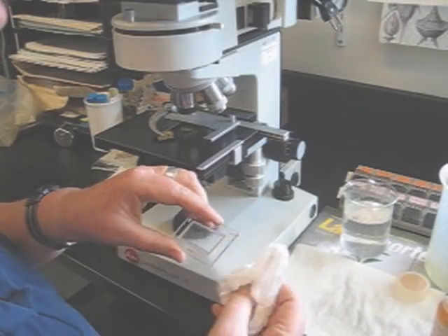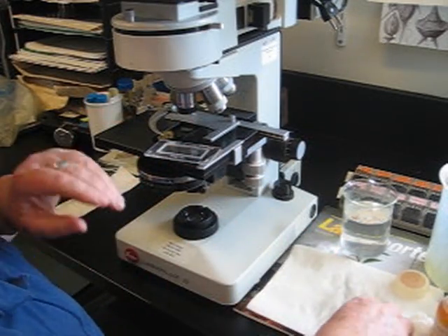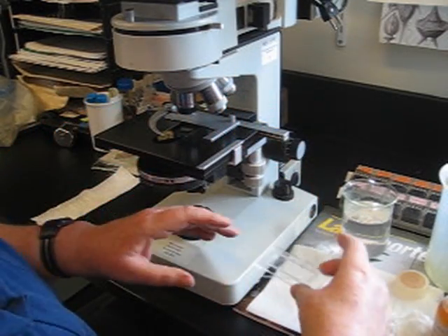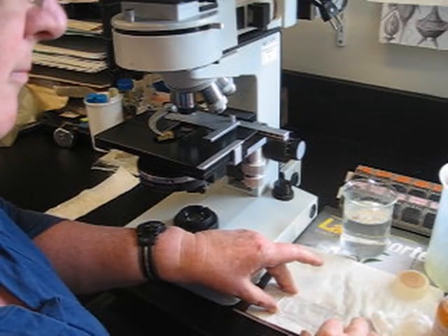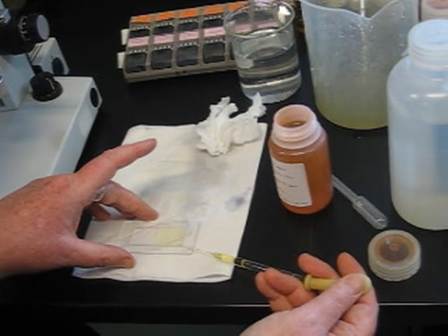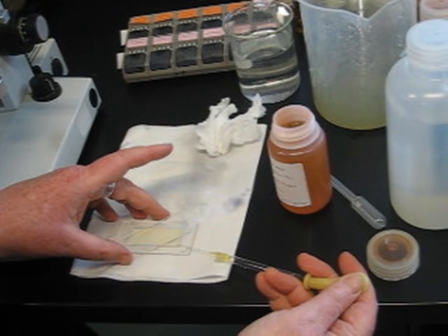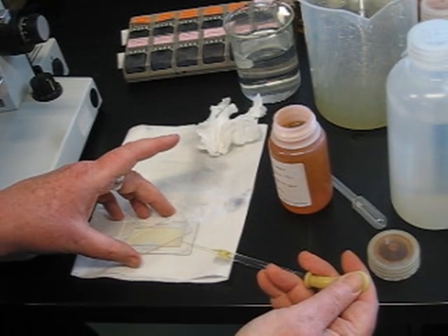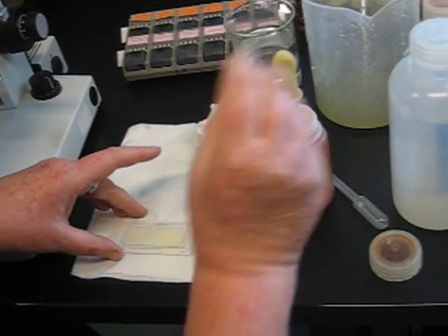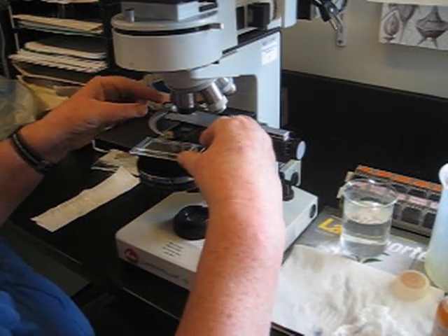Sometimes you're not quite as steady-handed as you might want to be — maybe a little too much coffee in the morning. So you don't have to fill the slide on the stage of the microscope; you can fill it beside the microscope. Just put it down on a piece of paper towel or other paper, and again with your pipette as close to horizontal as possible, fill it from the corners, bring the top slide around, wipe off anything you spilled, and put it on your microscope to settle.